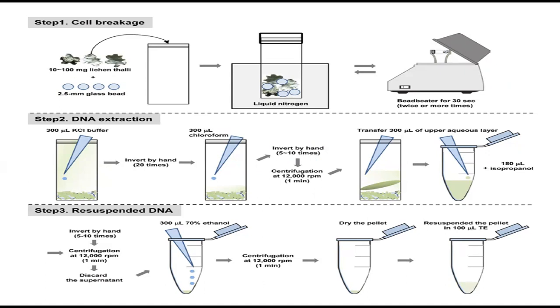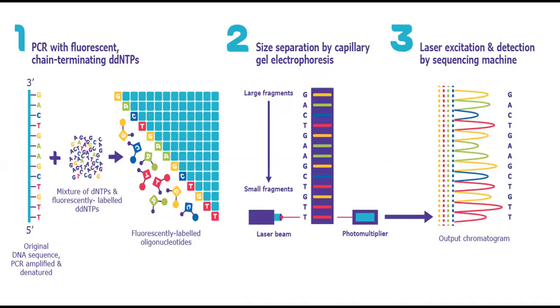After that, by extracting DNA, you have to sequence it, and this is the process of sequencing, and it is a very complicated process. But just keep this in mind, why you are performing sequencing: because you want to know about the whole DNA sequence of your microorganism. Okay, so for example, this is the entire DNA sequence of your microorganism.